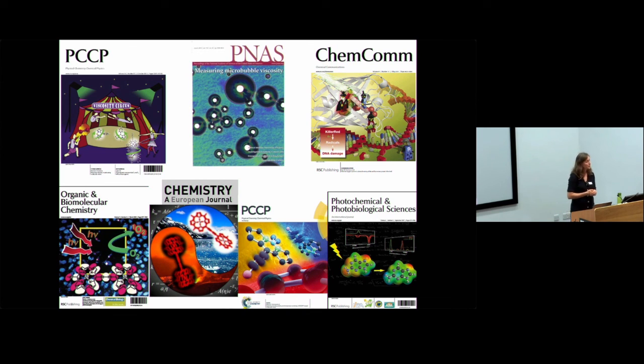The reason why the dye on its own, when you infuse the cell with it, doesn't go to other membranes is simply because it has a much higher affinity. You mean the Halo one? I think we were just lucky with BODIPY. If you make any rotor based on cyanine dyes, it will just have non-specific binding everywhere because its hydrophilicity is such that it prefers to go to mitochondria no matter where you target it. But BODIPY somehow is driven by this Halo tag interaction. I guess it might end up in other parts of the cell, but it probably is not bright enough because viscosity is low. So what we see is really beautiful staining corresponding to the organelle of desired targeting.